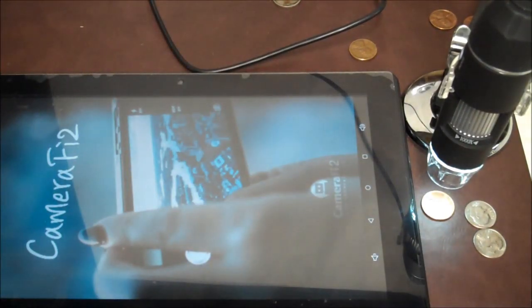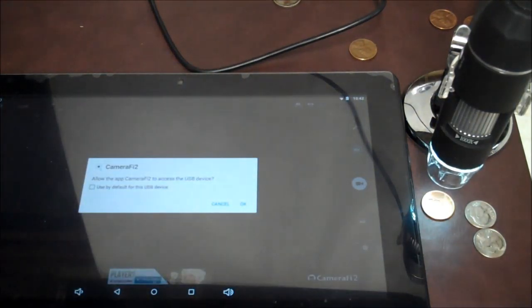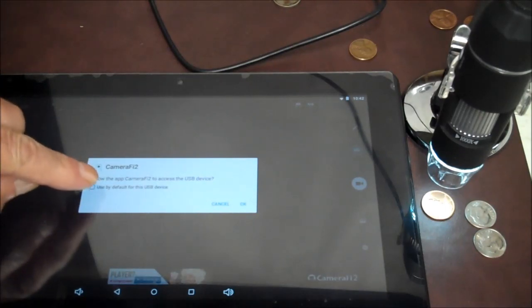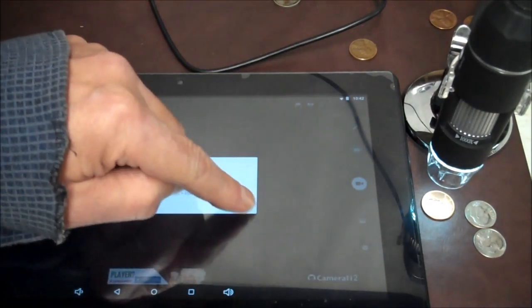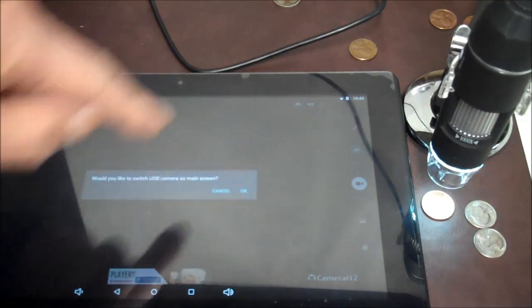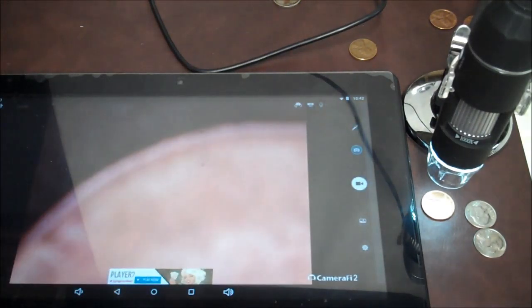Now what I liked about this CameraFi is it has some filters you could apply and it does have ads that are annoying, but I'll just have to deal with that. I'm going to make this my default so I get to get rid of that other one. Yes, I would like to switch to the USB screen.